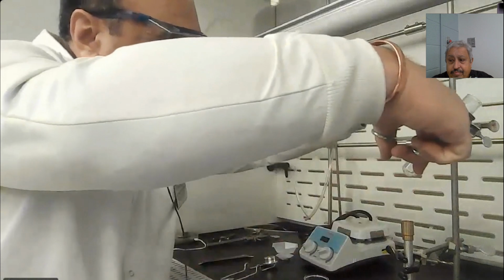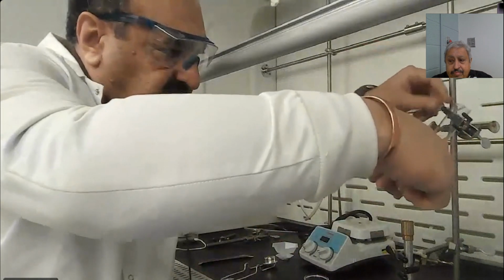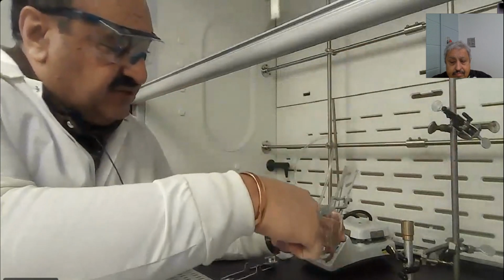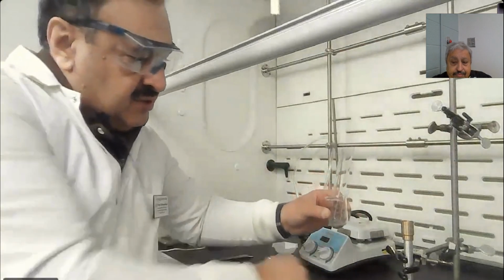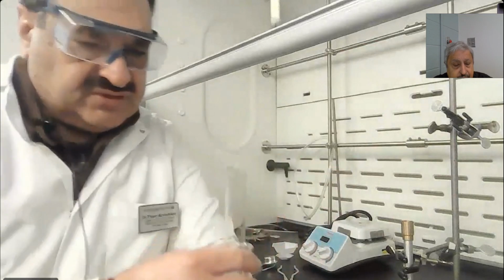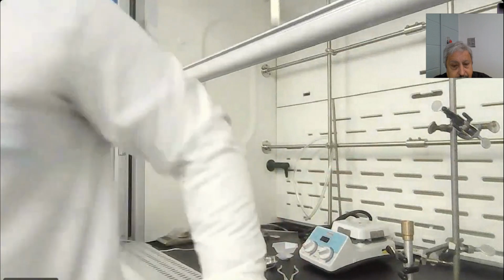Put the test tubes inside the beaker, like this. Okay. Make sure your test tube is a little bit full. Take the mass of the empty test tube.